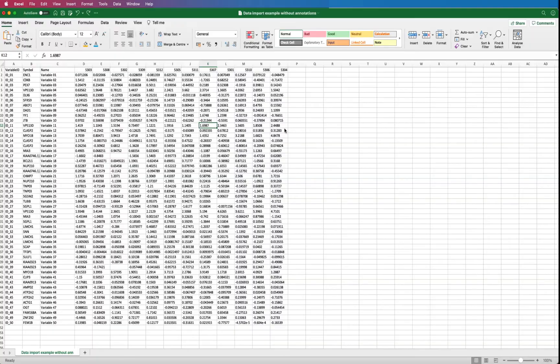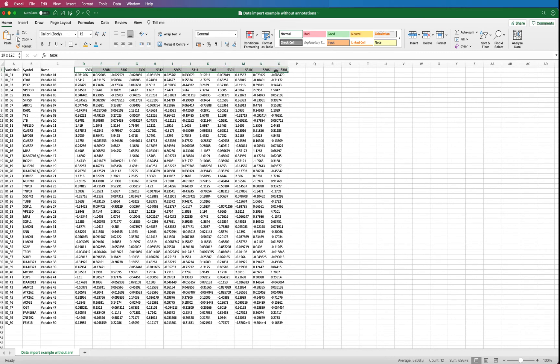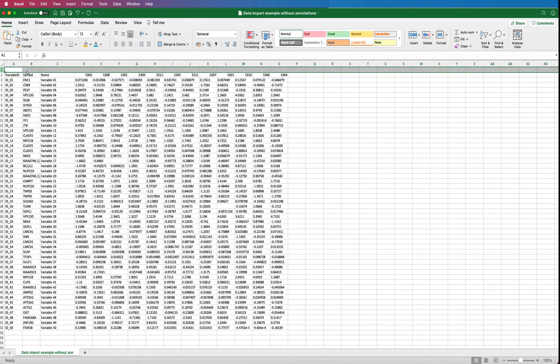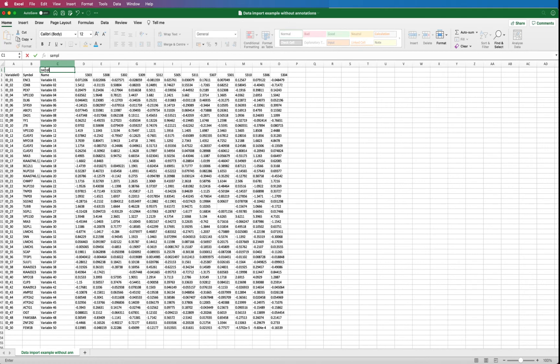Your data file can have different layouts. Here is another example. In this case, you don't have any sample annotations, except from unique ID. You can edit the file by inserting a blank row to make room for a sample annotation, but you can also import the file as it is.